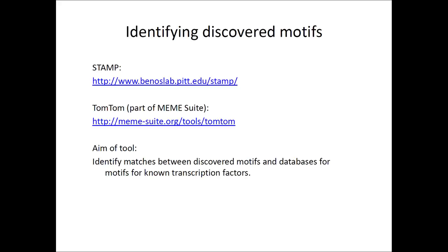Motifs can be compared against several databases, but the most useful, to me at least, are JASPAR and TransFAC. The TransFAC database is an older open access version, but arguably contains more motifs than JASPAR. JASPAR is open access and has been curated, but in this case is also quite out of date. However, both in this case are good enough for a quick look to see what your motifs resemble.